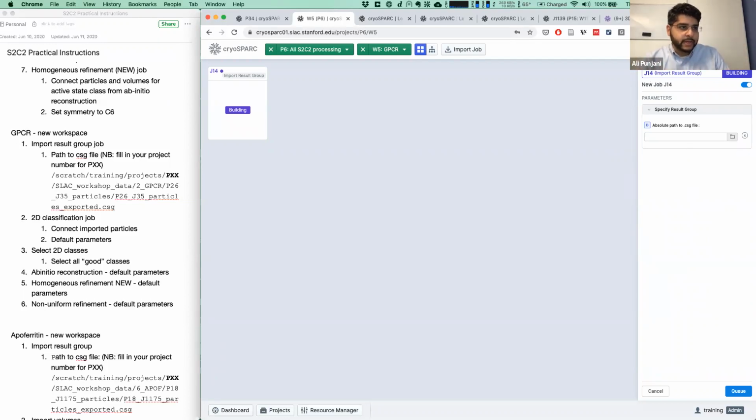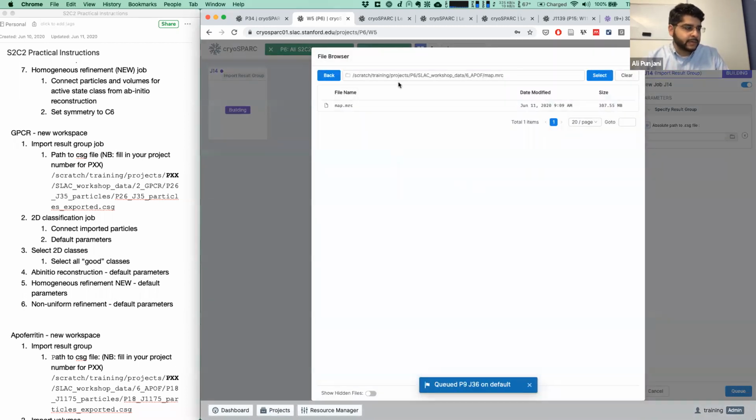instance. The only caveat is that the data that you're importing has to be inside of the project directory where you are importing it. And that's on purpose because we want to make sure that project directories remain fully self-consistent and self-contained. So in our case, we've taken care of that by creating some helpful symlinks.